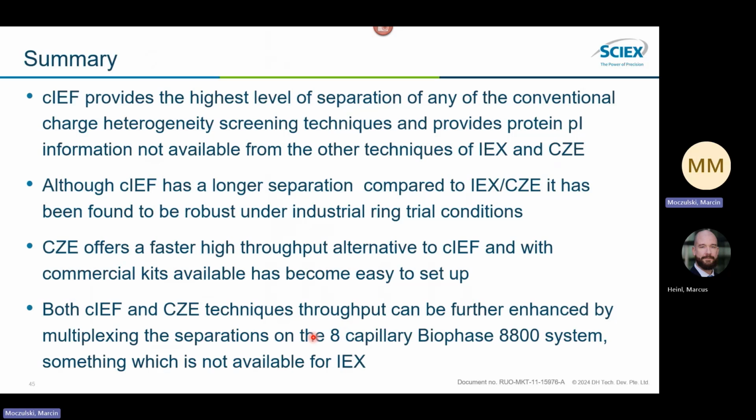Summarizing all the information, the capillary isoelectrofocusing method provides the highest level of separation of any of the conventional charge heterogeneity screening techniques and provides protein isoelectric point information not available from other techniques like ion exchange chromatography or capillary electrophoresis. cIEF is a longer separation compared to other techniques and has been found to be robust under industrial ring trial conditions.